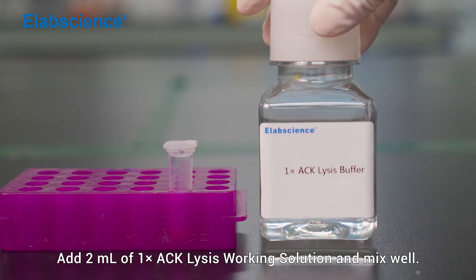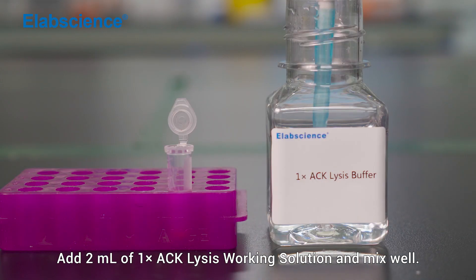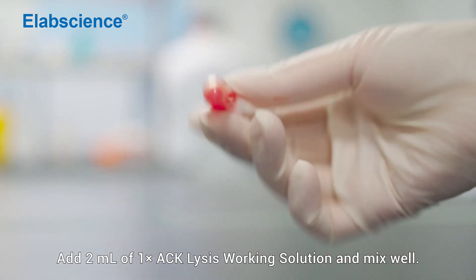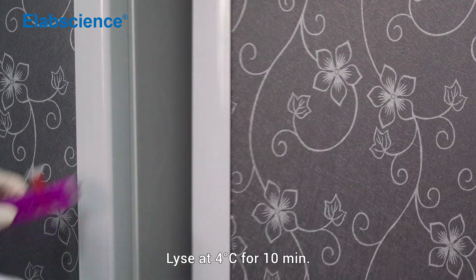Add 2 mL of 1× ACK lysis working solution and mix well. Incubate at 4°C for 10 minutes.